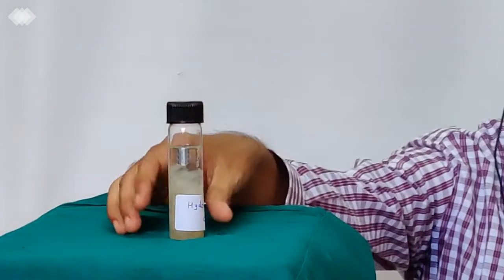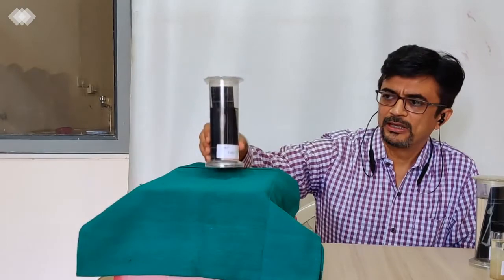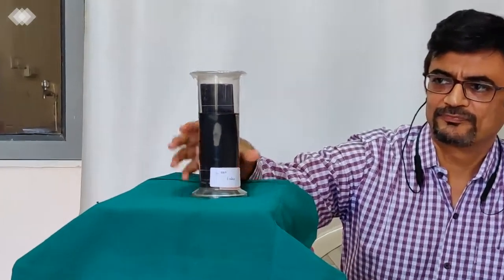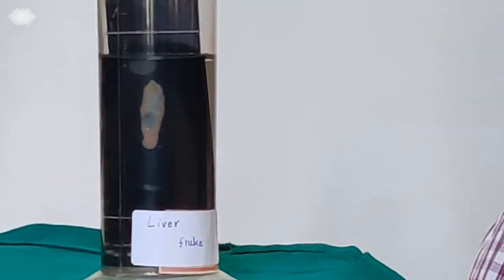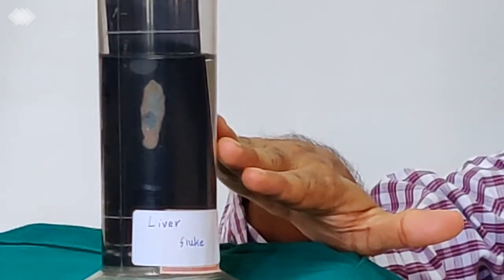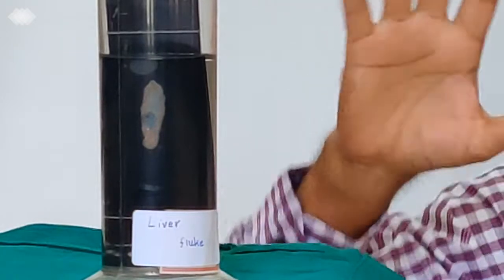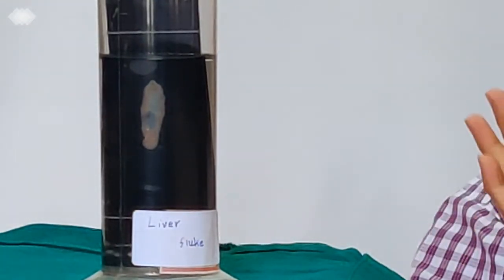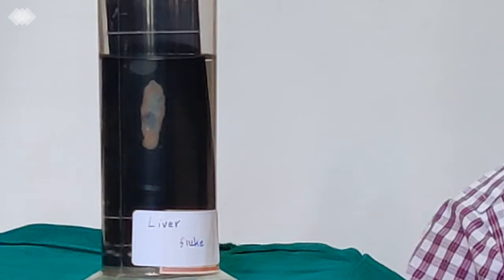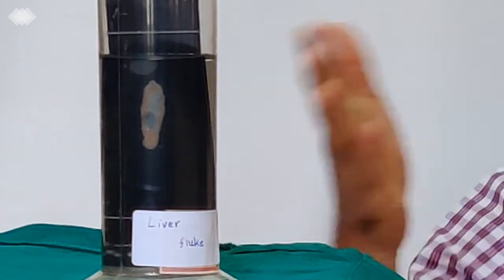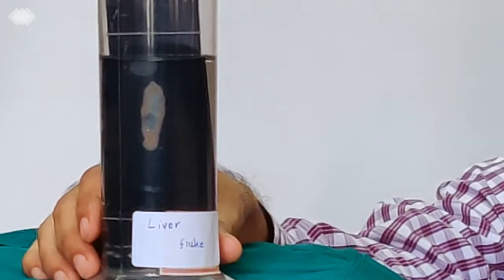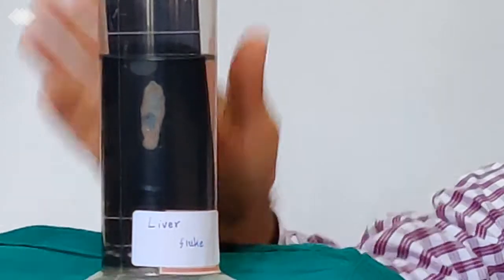The second, which is known as trematodes or which are also known as flukes. You can see the size and it is leaf-like. Its name is trematodes means it has a hole inside the body with which it would attach to its host. So this is liver fluke, so it is an example of trematodes.